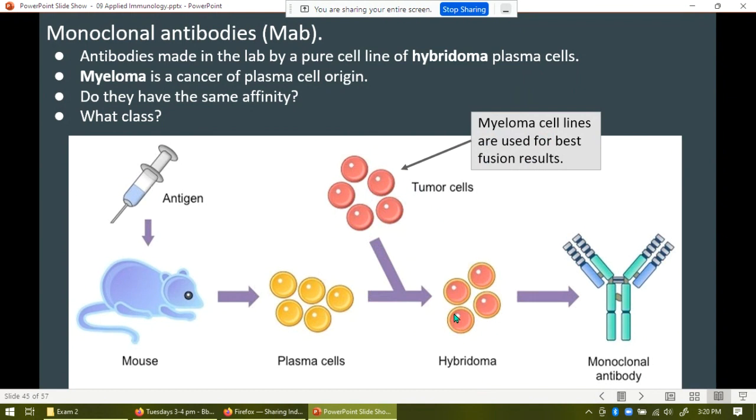Basically, you just give them new nutrients every 3 days or so, and they make tons of antibody for you. And you just grow these cells for as long as you want. And every few days you harvest the supernatant that contains the antibody that you want, and then you replace the supernatant with fresh nutrients, and you keep those hybridoma cells alive forever.